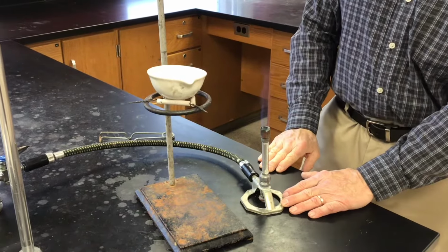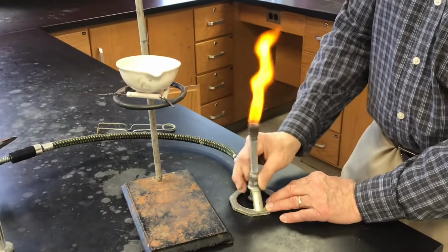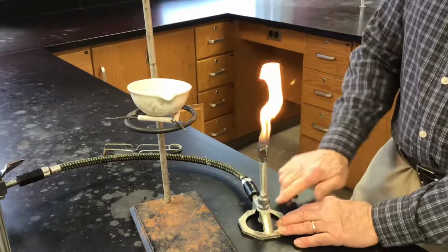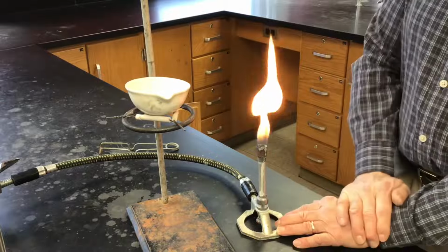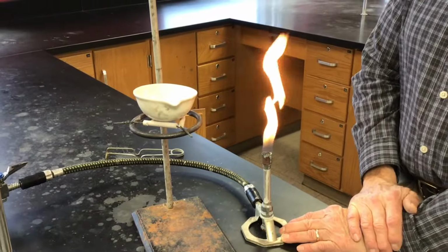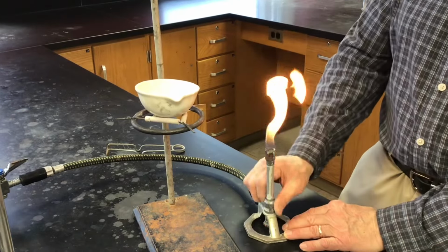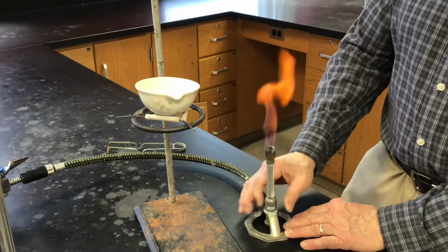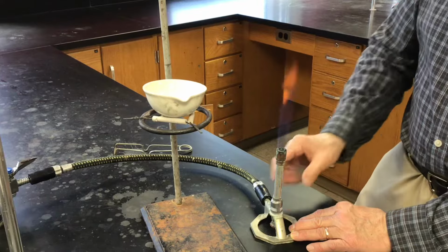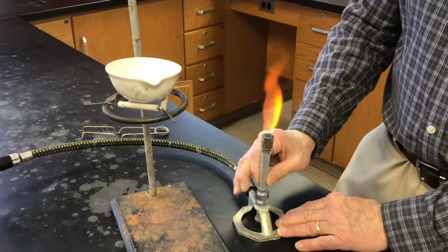Okay, and I don't know how well the flame shows up. Yeah, we can see the flame. If we haven't had a chance to use a Bunsen burner, if you lower the barrel all the way down, you cut off the oxygen supply, and you get the coolest possible flame. It's just yellow. There's a lot of gas that's really not even burning because there's not enough oxygen coming in. And then as you raise the barrel, you let some oxygen in the bottom here. You get a hotter flame. It's blue now.